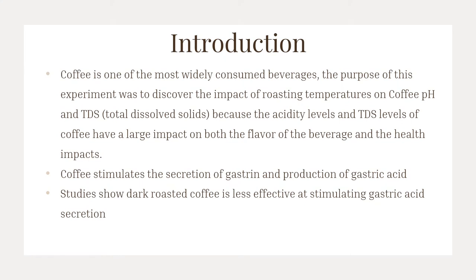Coffee is one of the most popular beverages worldwide. In fact, 75% of the U.S. population 20 and older reports drinking coffee, with nearly 50% drinking it daily. The purpose of this experiment was to discover the relationship between coffee roasting temperatures and coffee pH and total dissolved solids, because acidity levels and total dissolved solid levels of coffee have a large impact on the taste and the health impacts of the beverage.